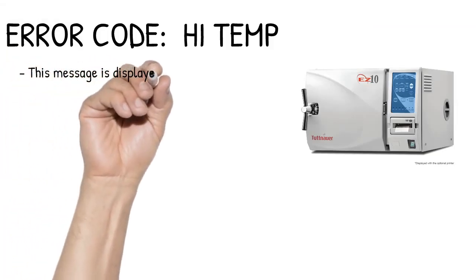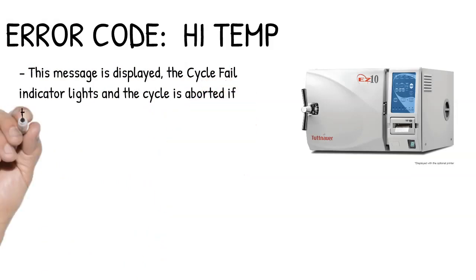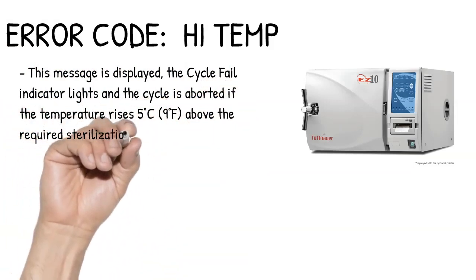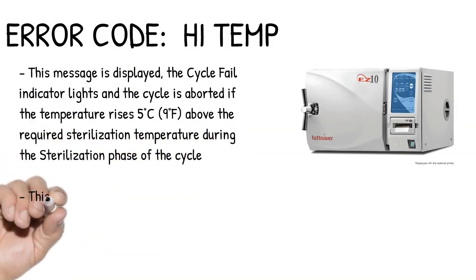This message is displayed, the cycle fail indicator lights, and the cycle is aborted if the temperature rises 5 degrees Celsius, 9 degrees Fahrenheit, above the required sterilization temperature during the sterilization phase of the cycle.